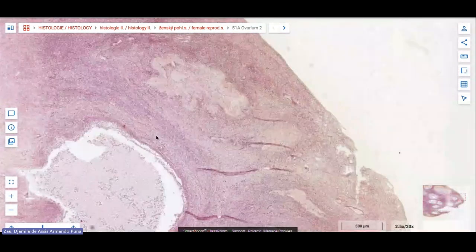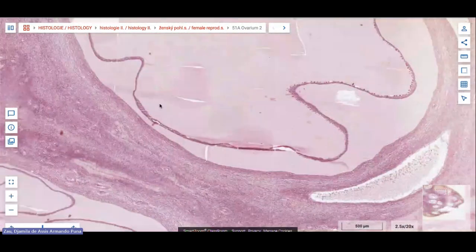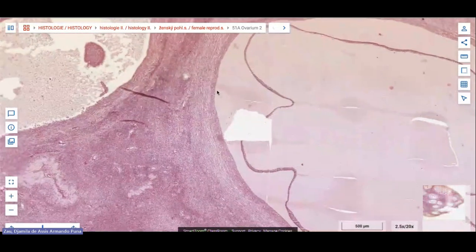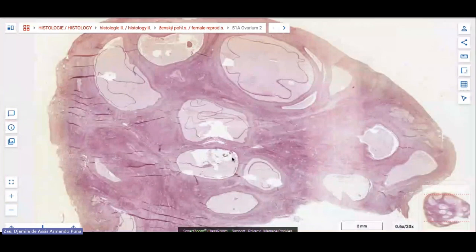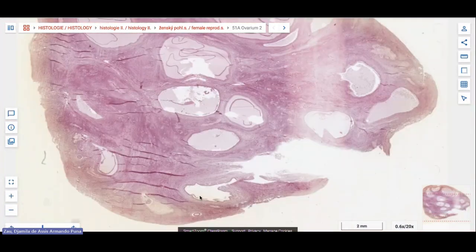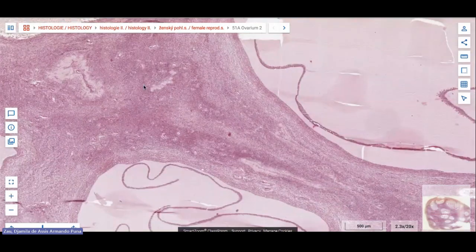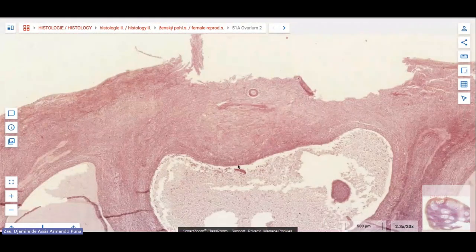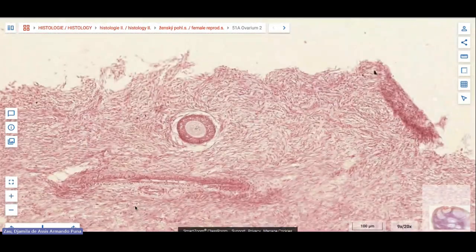Again, it's just a bit difficult for me to find some follicles, but anyways. So this was the ovary. You zoom out, you see the Graafian follicles. They will then somehow find a follicle for you, and you just let them know whether it's a primary or secondary, and why. And you guys will be able to tell it apart because they do not look alike at all.